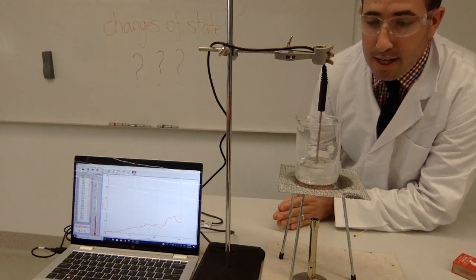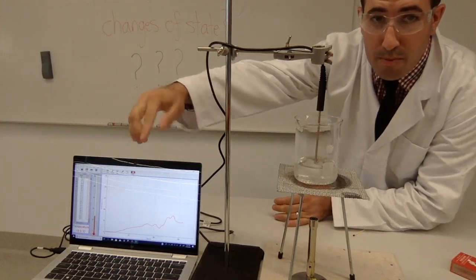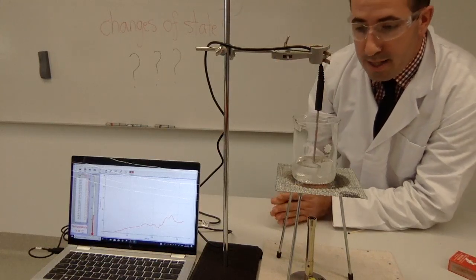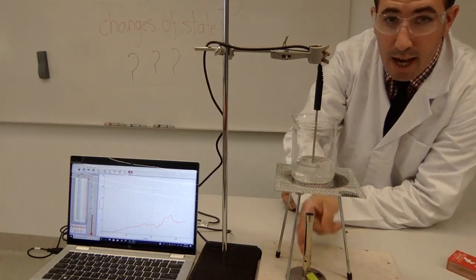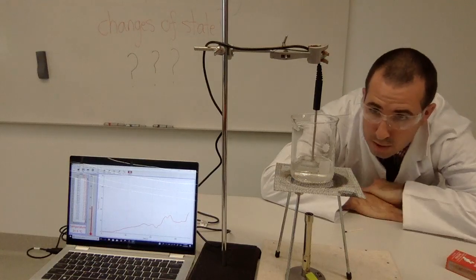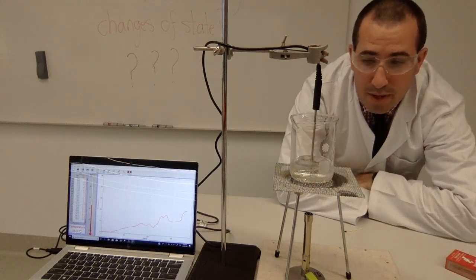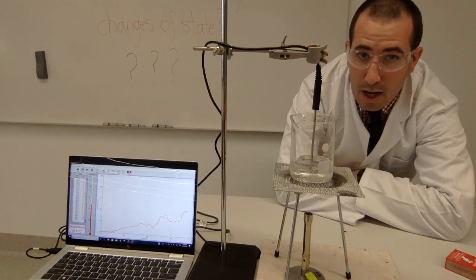Let's just continue boiling it. As we can see, the curve isn't as good as it should be. It should be relatively a flat line going upwards, but let's just deal with it. So we've got the heating flame on here to see how we are going. It's rolling along quite nicely. It's about 125 mils of water now in this system. Now, because there's a little bit of ice left over, that would obviously regulate the temperature a little bit.